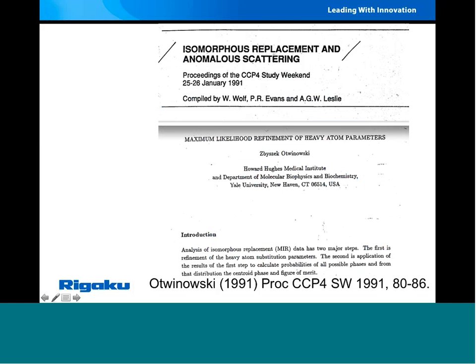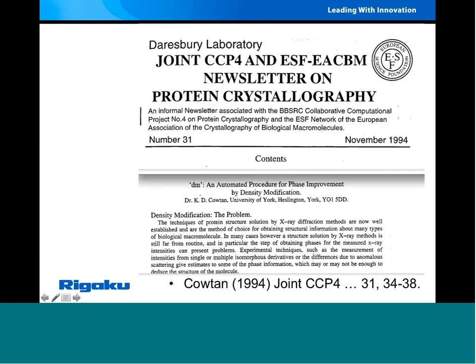We are now doing phasing, and since we're using MLPHARE, I wanted to show the reference, which comes from the proceedings of the CCP4 study weekend from 1991. There's a little booklet called Isomorphous Replacement and Anomalous Scattering, and this is the place where Zbyszek published his MLPHARE program. In addition to that, we'll follow that with solvent flattening with the program DM from Kevin Cowtan, and he published in a Daresbury Laboratory publication, which was essentially a CCP4 newsletter from 1994.